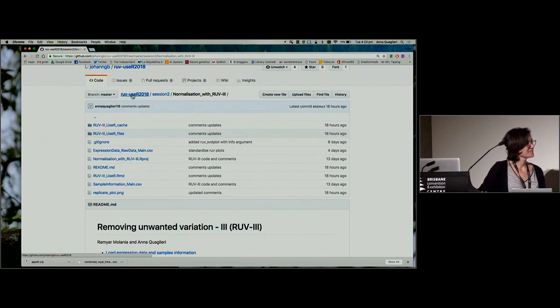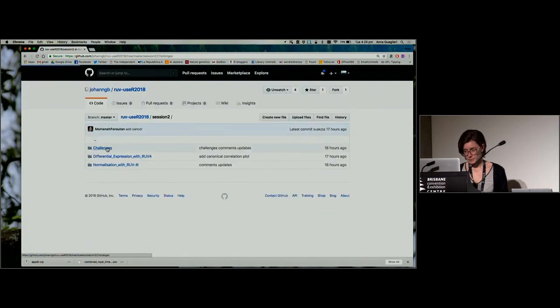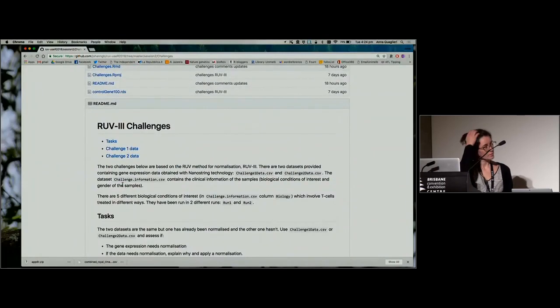Yeah, as Johan mentioned, positive control is a key component for all studies, not only for this one. Without having positive control, you can't claim that your data is normalized. We have plenty of positive controls here. We have the PCA, the plots, and some genes whose biology we know, and we use different Ks to get those positive controls right.